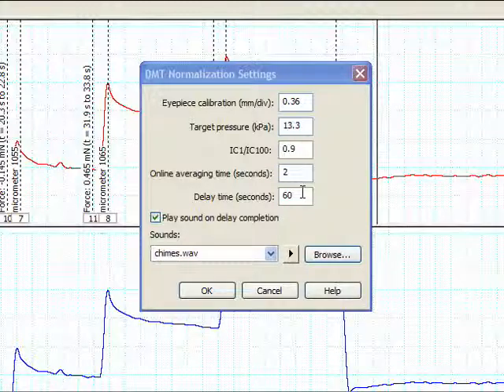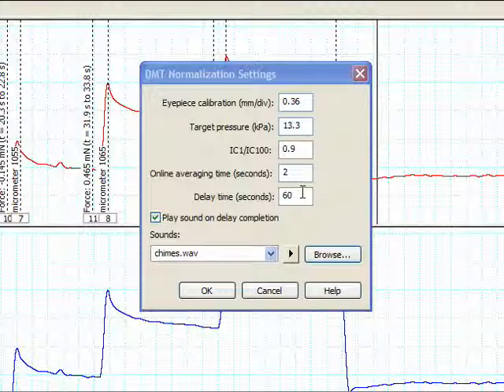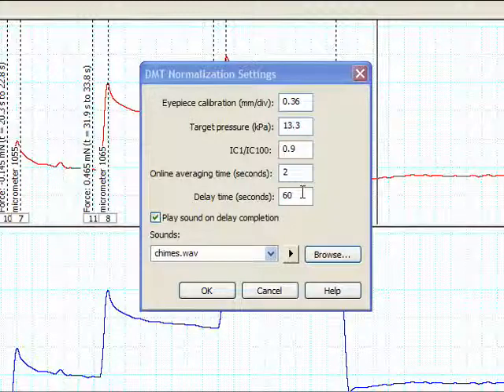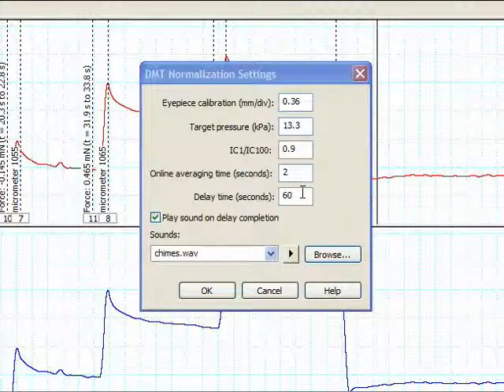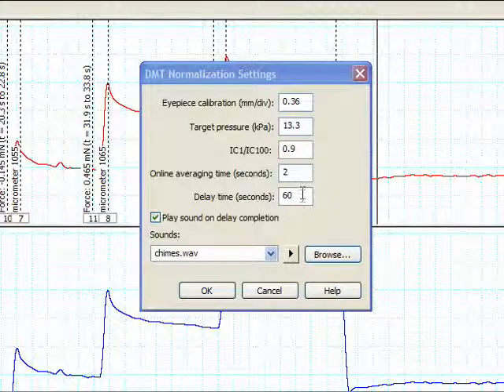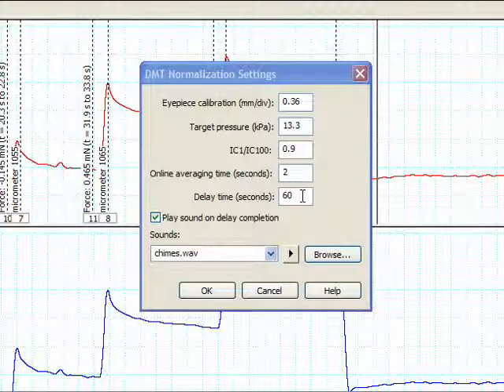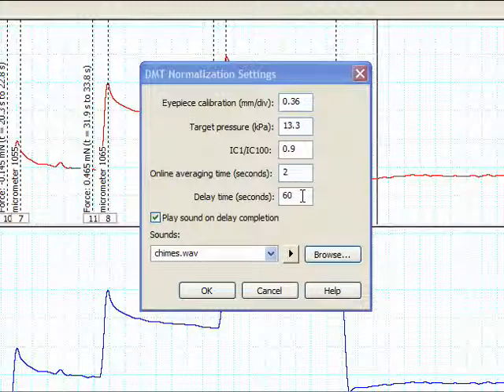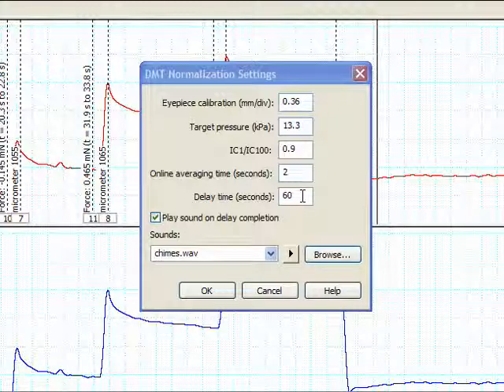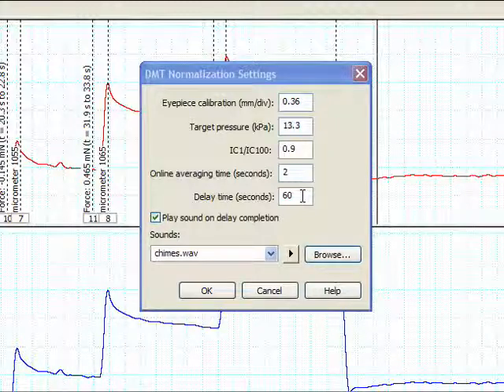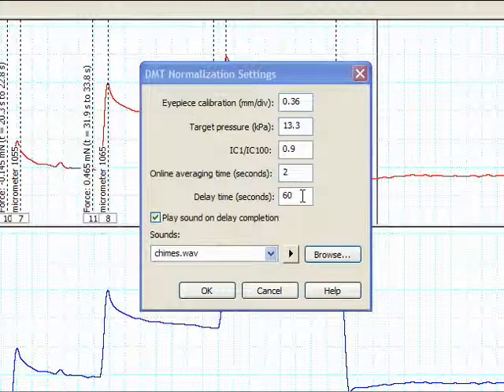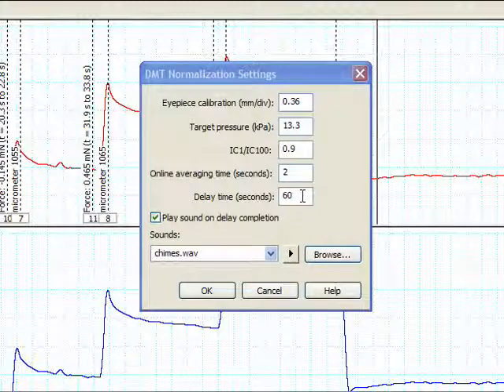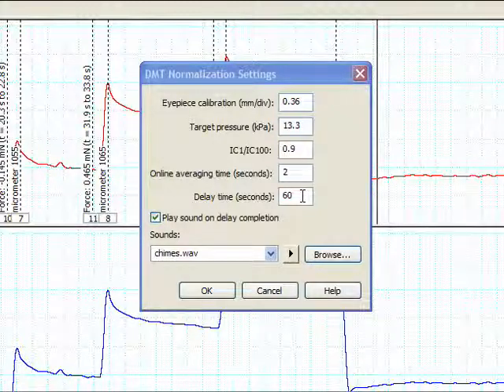If you perform the normalization procedure online, you will also set up the module so that when you click add point there is a delay before the force data is added. This is useful when you know how long the force reading will take to stabilize after the vessel has been stretched. You are able to click add point immediately after adjusting the micrometer and entering the new setting, and the force data will be added automatically when the delay time period ends.